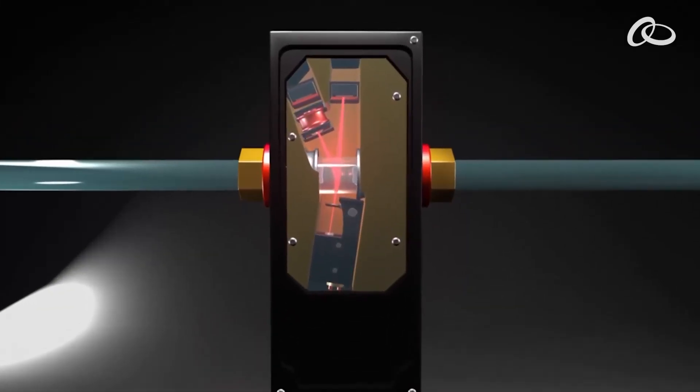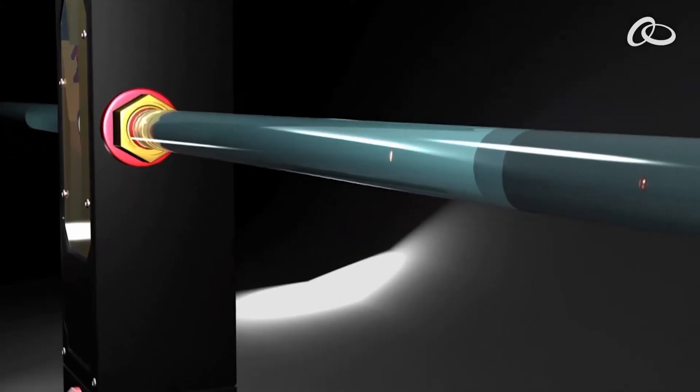The AccuSizer is based on the technique of single particle optical sizing, or SPOS.